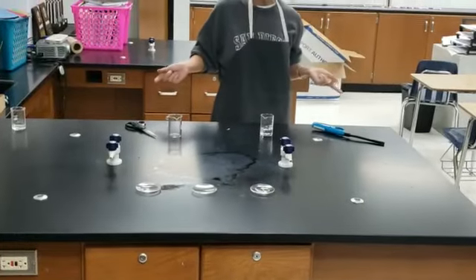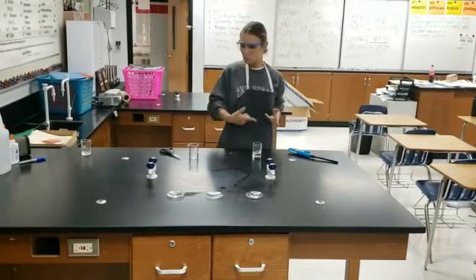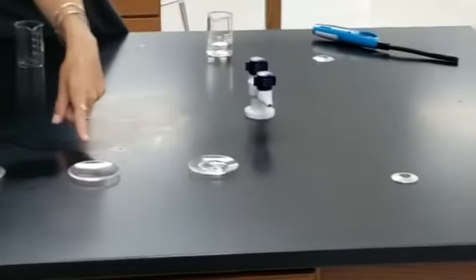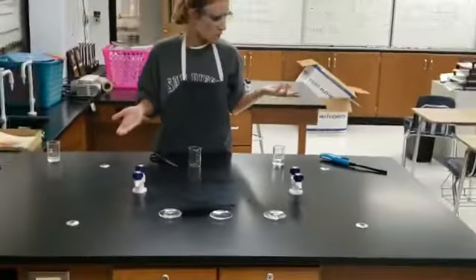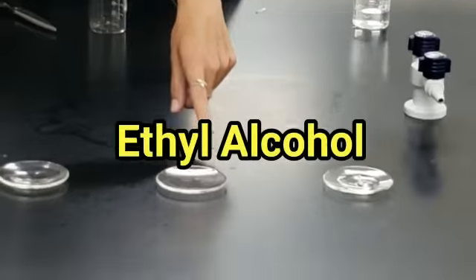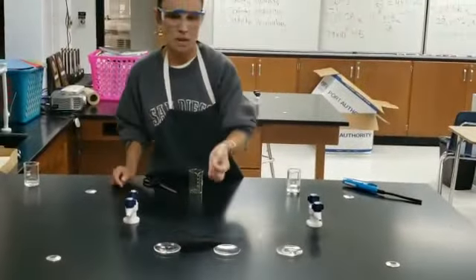Also remember this: it is very important to label your chemicals and to know what they are, because I had three clear liquids. They all looked the same, but all of them had different properties. Nothing happened to the first. The second liquid was highly flammable. The third liquid was highly corrosive. By their properties I can tell you: this is water, this is ethyl alcohol — and all alcohols are extremely flammable — and this is acid, specifically hydrochloric acid. All acids are corrosive and eat away metal.